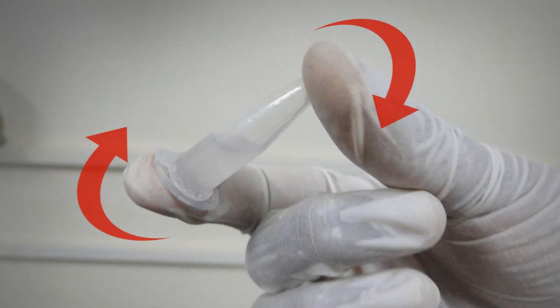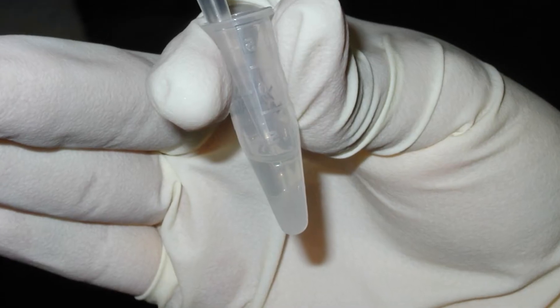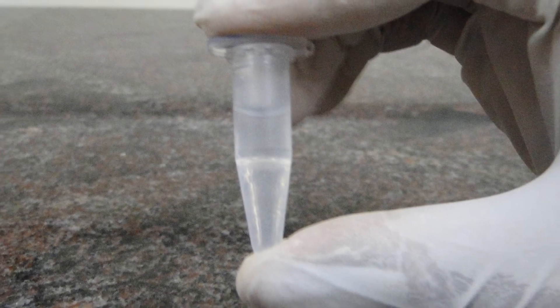Now, invert the vial by hand 5 times as it can't be vortexed. Store it in ice for 1 minute and add 150 microlitre of lysis solution 3 to the same vial. Invert the vial again by hand 5 times and store it in ice for 3 to 5 minutes.